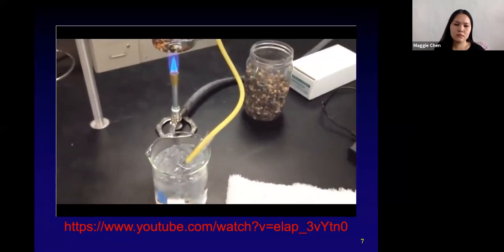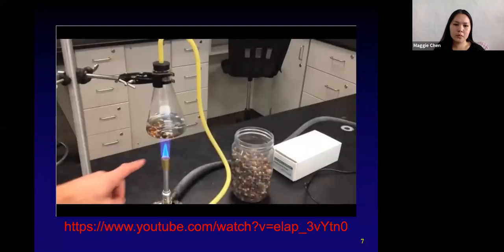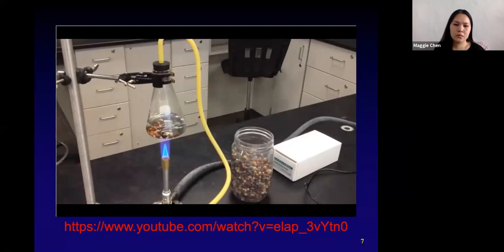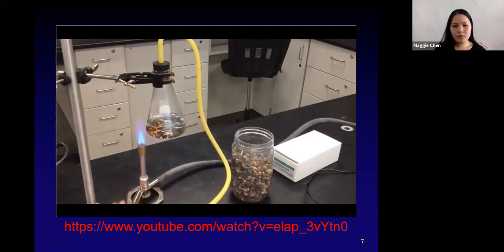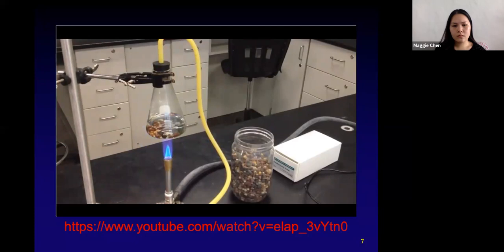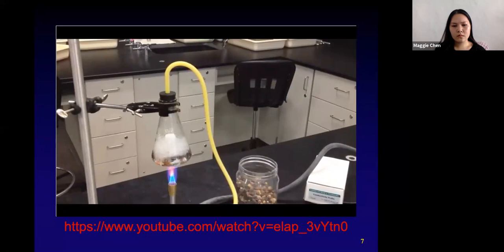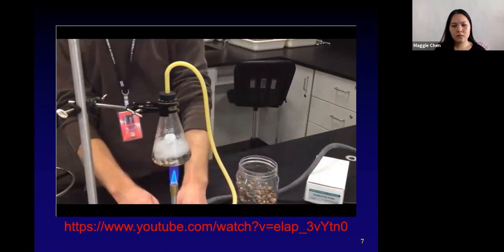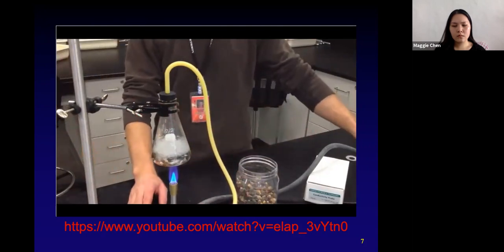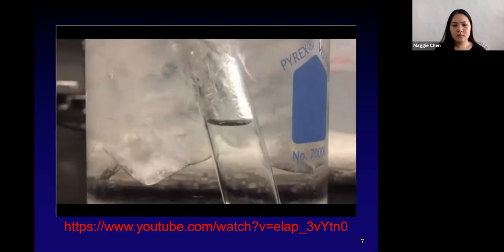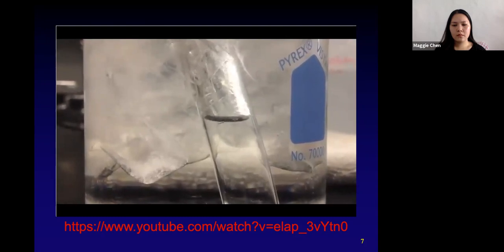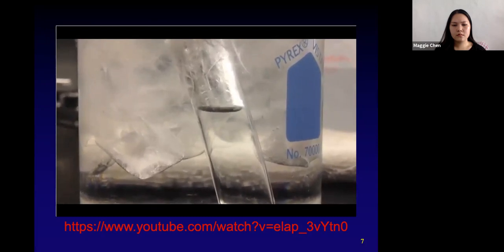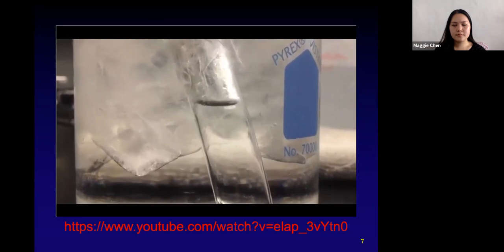Begin heating your salt water, making sure everything looks good. The tube should go all the way down without any kinks, into your clean collection test tube in the ice water bath. You want a nice medium controlled flame so things don't get out of hand — if it boils over too much, you'll contaminate your test tube. If things get out of hand, move the Bunsen burner out from underneath the flask first. You can see the level rising in the test tube inside the beaker — we're collecting distilled water as it boils and condensing the steam into water in the ice water bath.